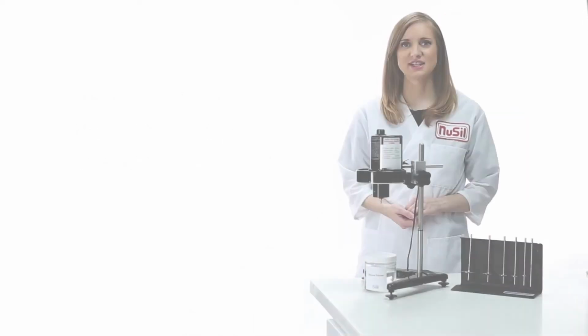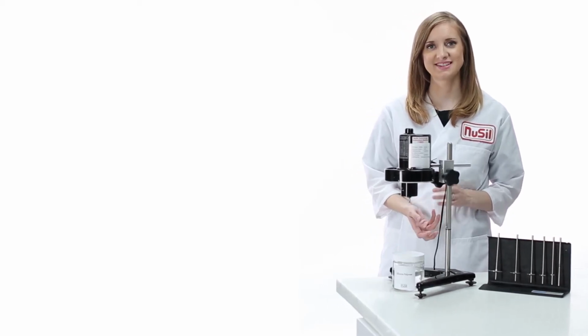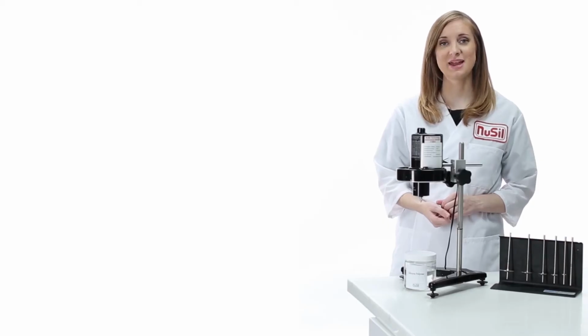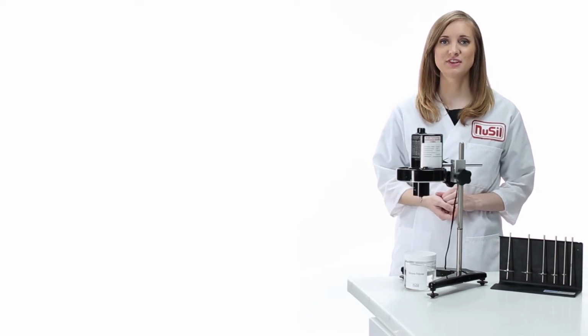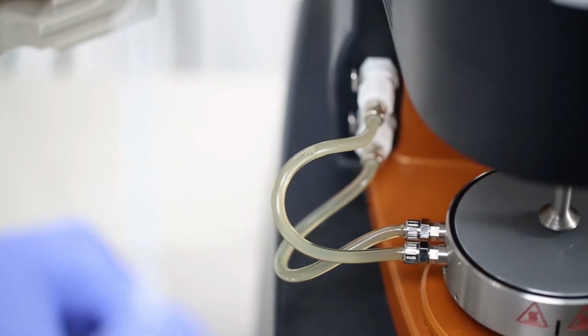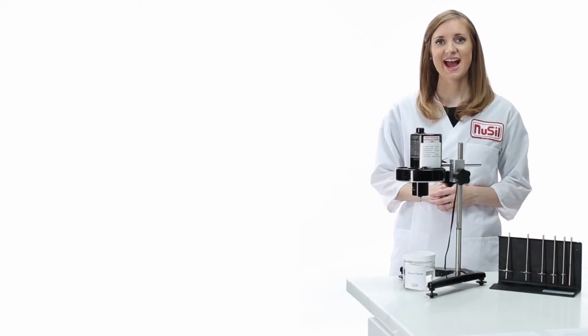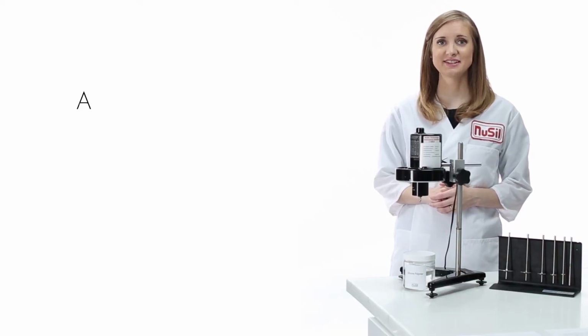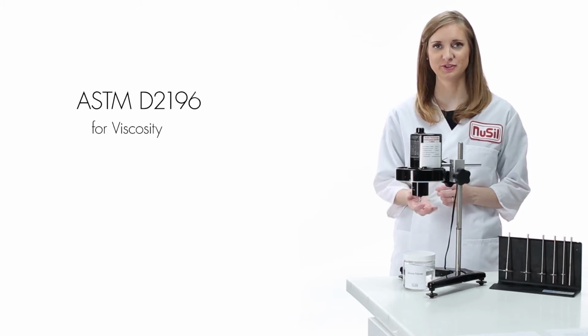We test viscosity by introducing a rotational force and observing the material's resistance to that force. Today, we will be using two different instruments for our test. First, we'll do some basic testing with this Brookfield viscometer. Then we'll move to a more sophisticated piece of instrumentation, a controlled stress rheometer, or CSR, to better mimic your manufacturing process. At NuSil, we test using ASTM standard D2196 for viscosity on the Brookfield.